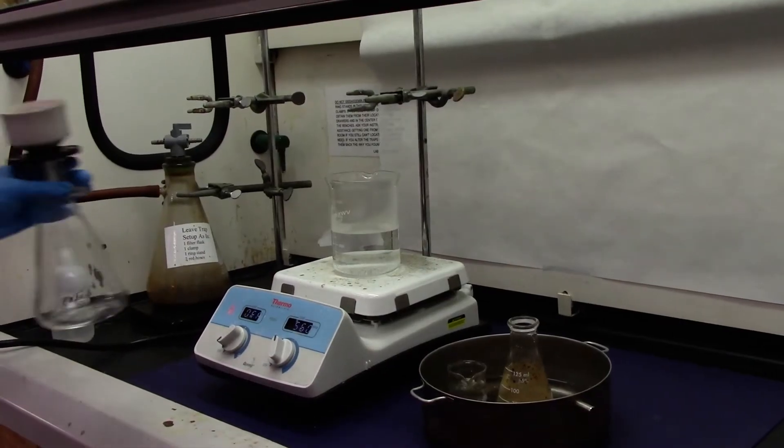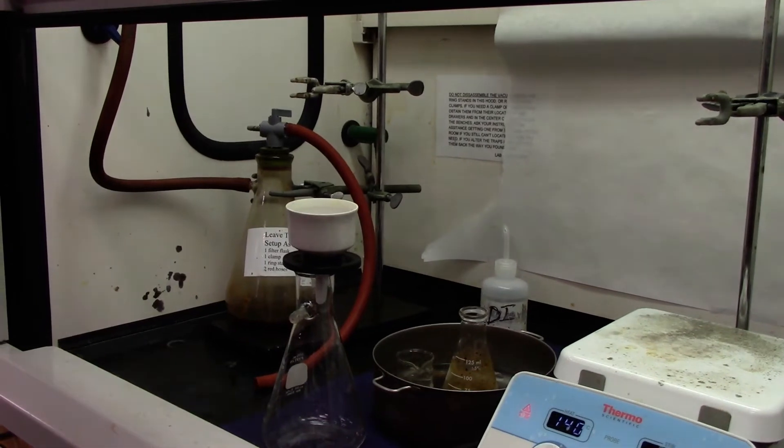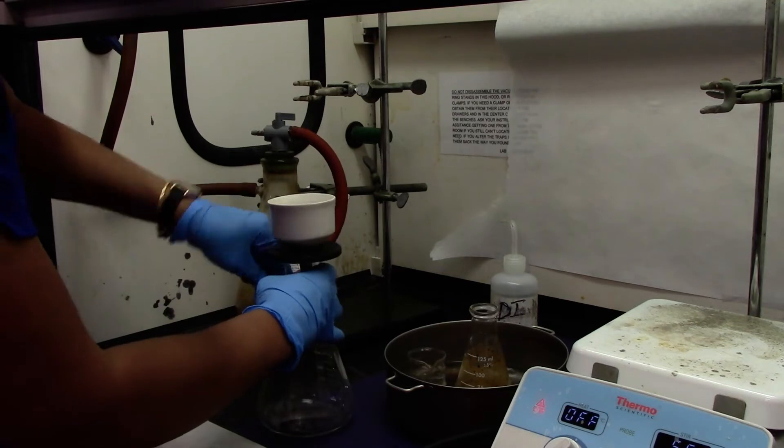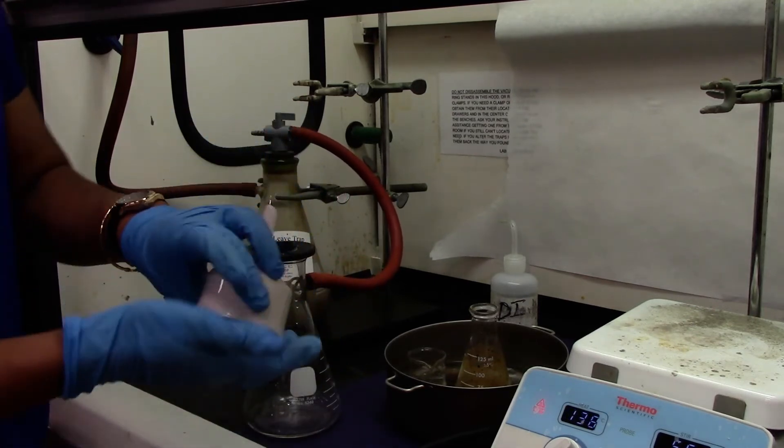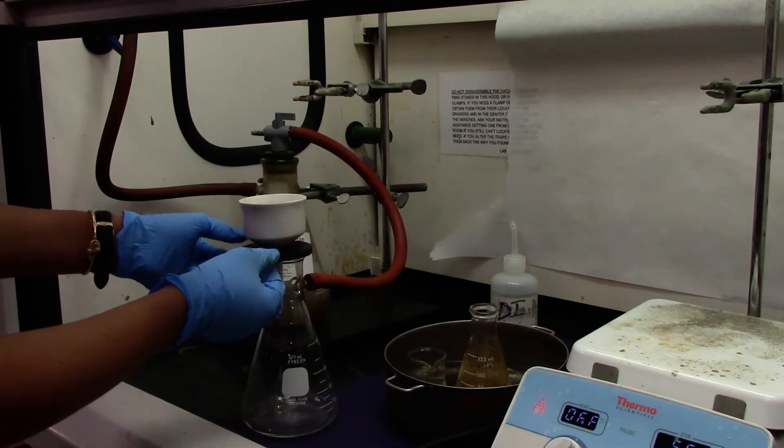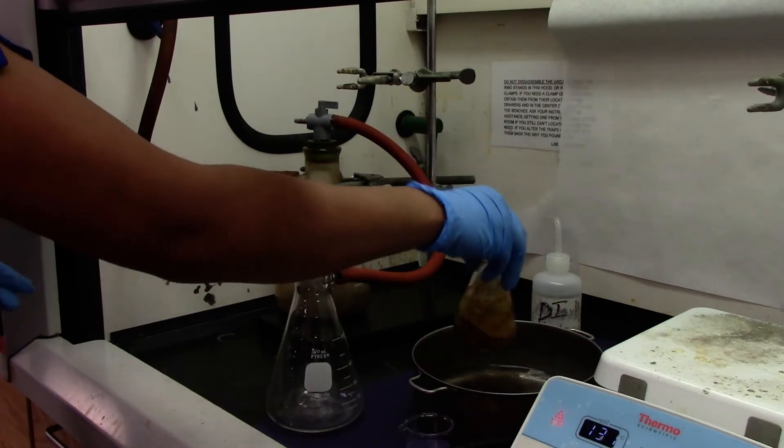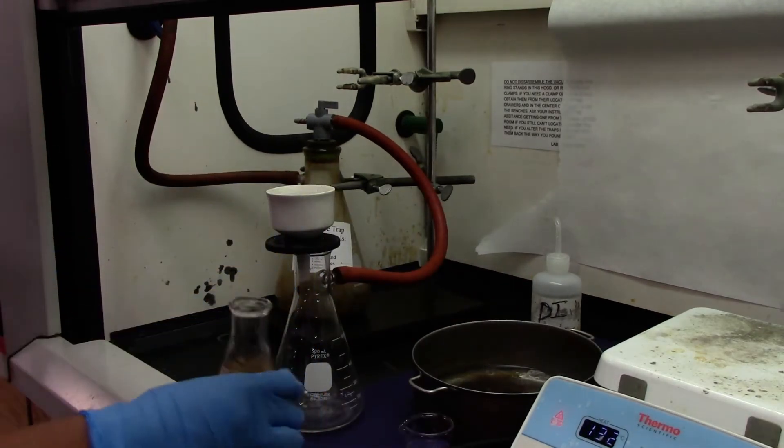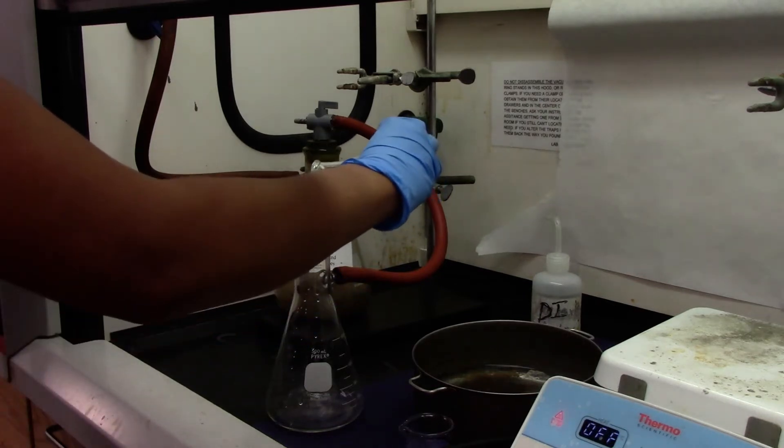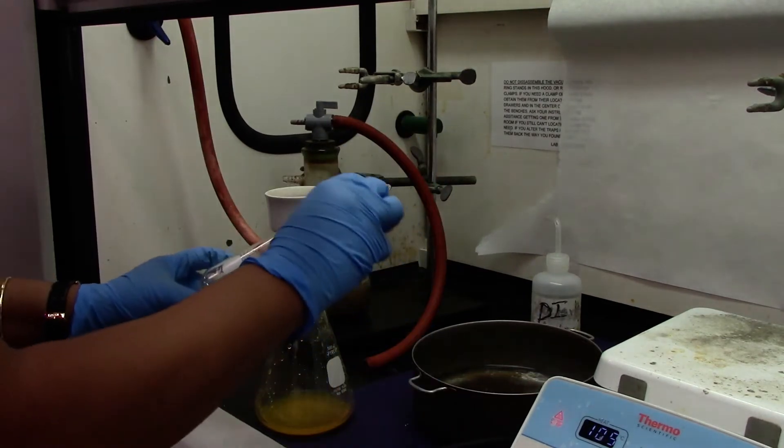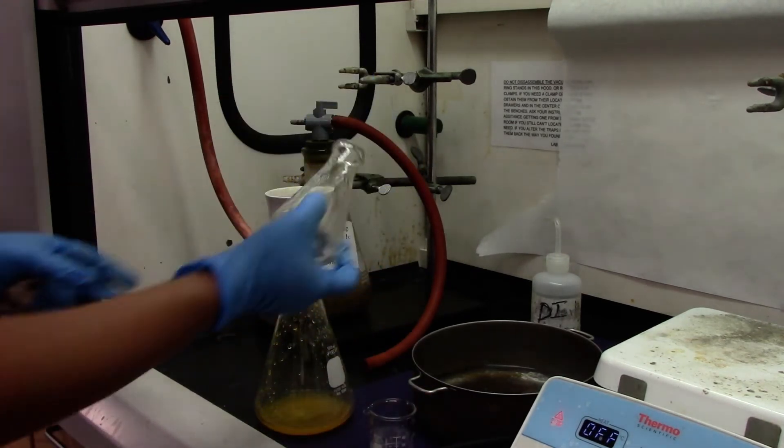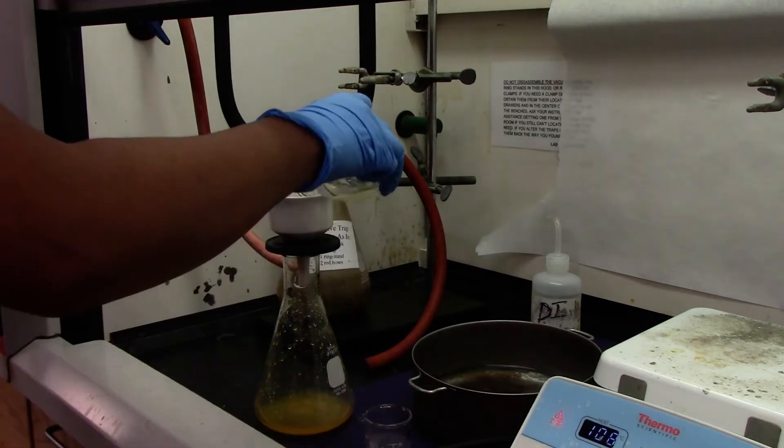Now we will set up the filtration. Connect the orange hose with the filtering flask. Use a filter paper on the funnel. Use a filtration adapter. Turn on the vacuum and transfer. Wash the Erlenmeyer flask with some ice cold water to get most of the product into the filtration funnel.